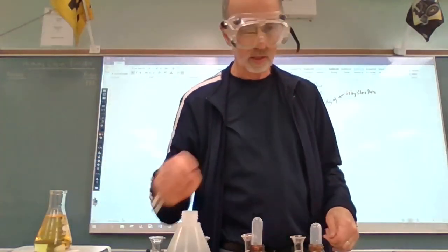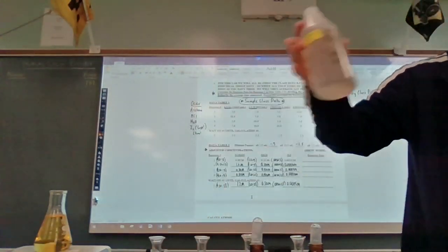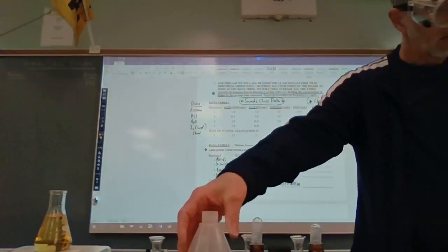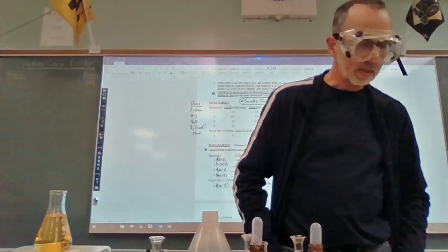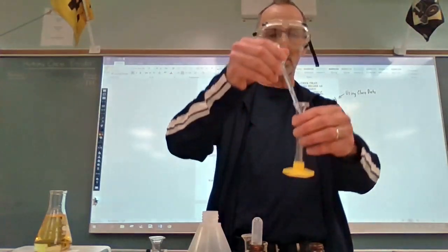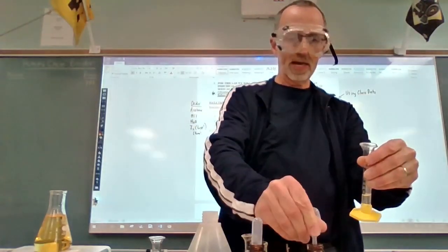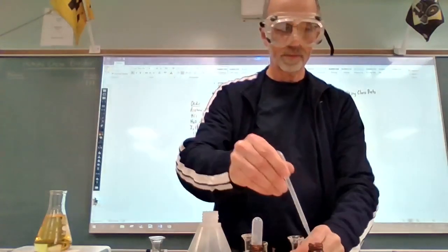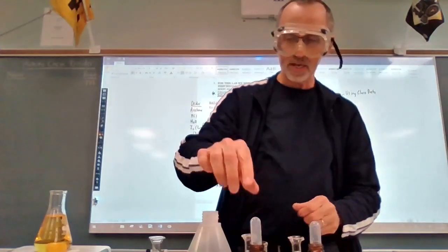Okay, we will clean this out, rinse it out, and get ready to run reaction 3. So now I just need 5 mLs of acetone. Back to 5. 10 mLs of HCl this time.